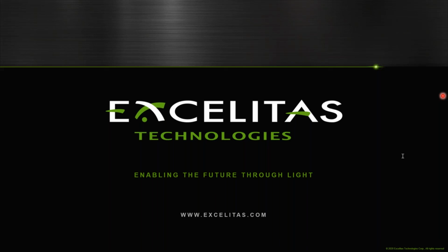So quantum dots takes me back like 15 years when they first came out, and I have not revisited it, except for in biological applications where lasers used to be used. I don't know the answer to that because I have not played with quantum dots in several years now. But from what I have seen over the years, I don't see an issue, because if lamps and lasers were able to excite quantum dots, I think our LEDs would be able to match them.